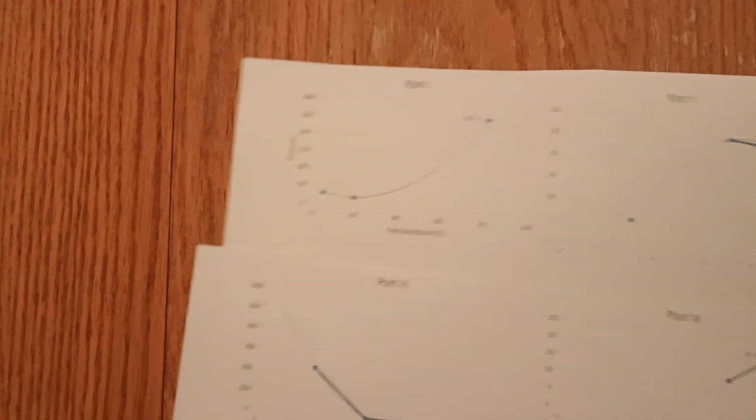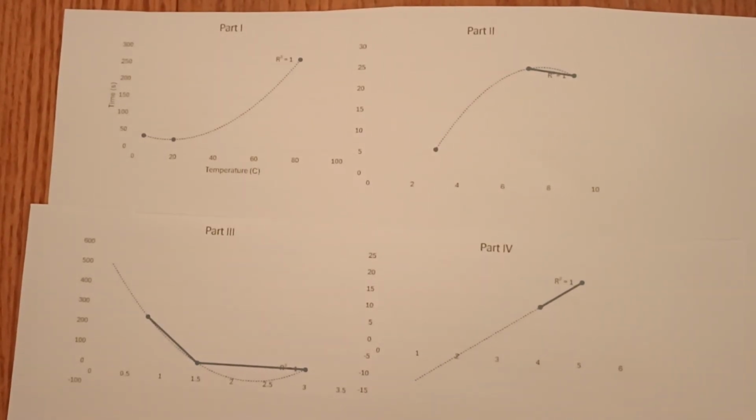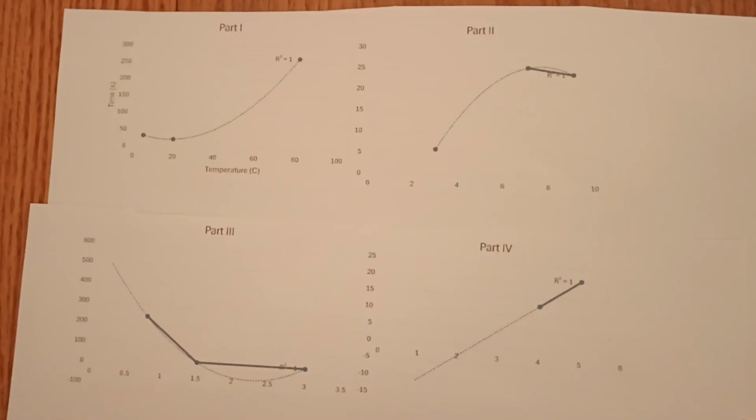Remember that we wanted to see how the enzyme in the potatoes reacted to the various environments we put it through, and we made some predictions. Let's revisit these hypotheses to see if our data holds them up. To help us see the trends, I've graphed the data and added a trend line.